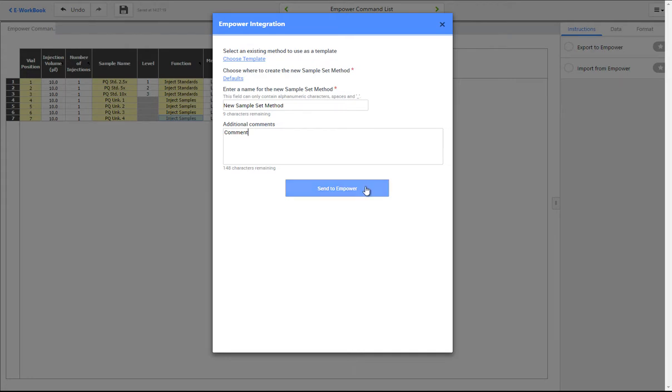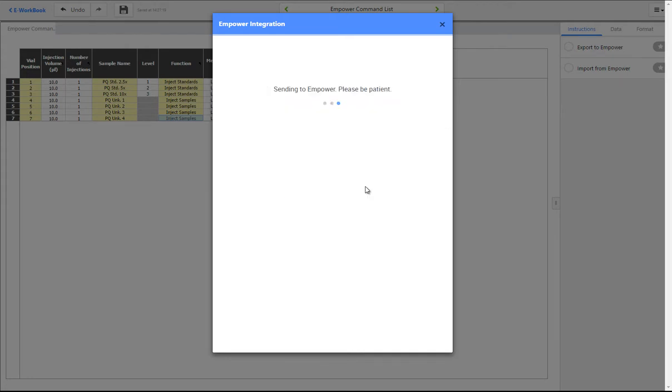Once the information has been entered, the data can be exported to mPower without the need for any manual transcription between the two applications.